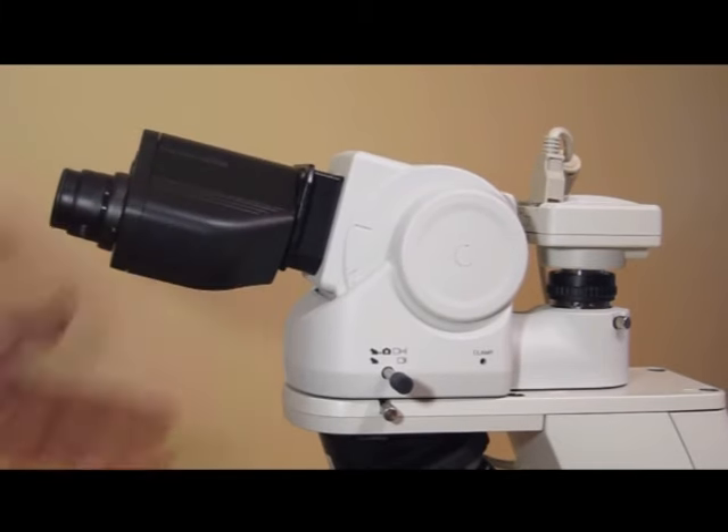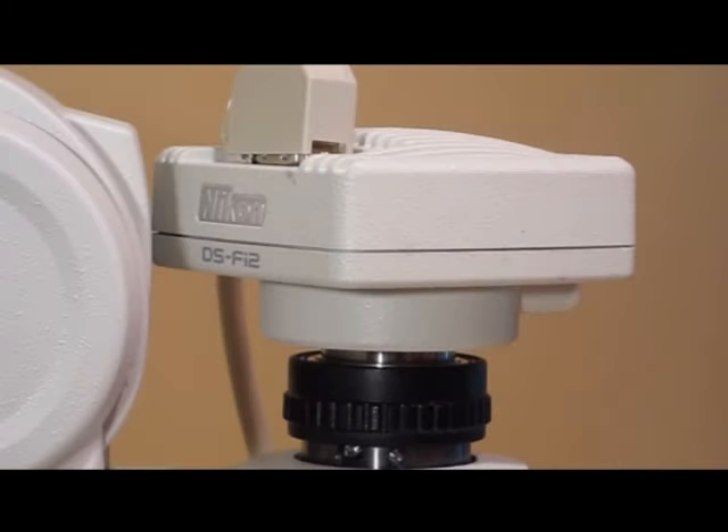Move into a comfortable position and then adjust the ergo tube. Nikon manufactures several microscope cameras. For most clinical applications, including pathology, the DSF-I2 fits the bill perfectly.